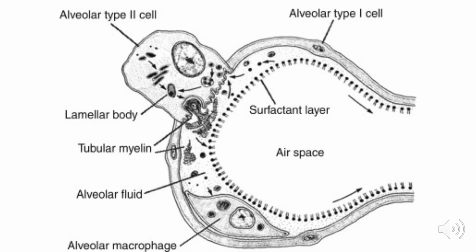This is a picture of one alveolus. This is the type 1 pneumocyte and this is the type 2 pneumocyte. Present in its cytoplasm are lamellar bodies, and these lamellar bodies will become the precursor for the pulmonary surfactants. And as you can see in the picture, the pulmonary surfactants function to lessen the surface tension within the alveolar walls to keep them open.